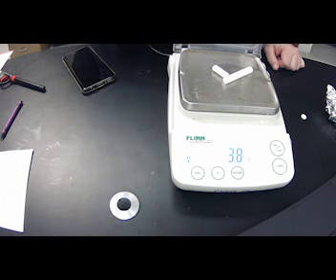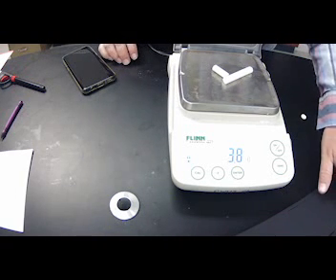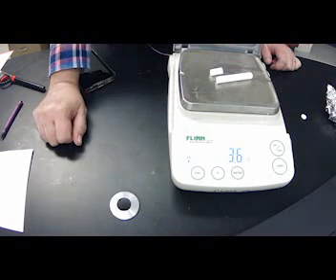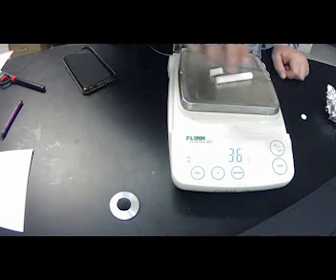I'm actually going to go outside for just a second. It'll be a quick in and out for you. And then I'll be right back. I'm going to write my name and maybe a nice message while I'm out there. All right. And we're going to weigh it again. It's now 3.6 grams for after. And now you can answer D, E, F, and G.